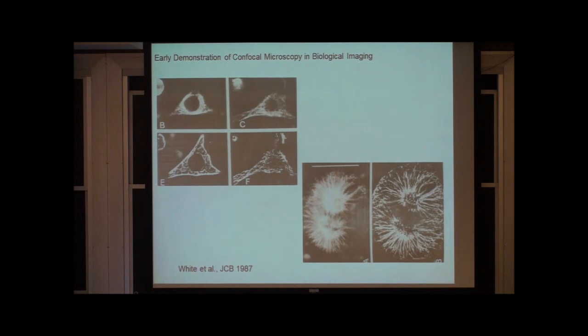And around the 1980s, a number of companies, specifically Bio-Rad, some of you probably use some of their products for various things, worked with a number of people, including Dr. John White, who at that time was in England, but now is in Wisconsin, and started to develop again a confocal microscope and tried to image biological specimens. So this is actually one of the earlier papers from John's group.